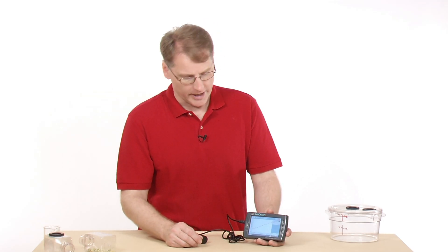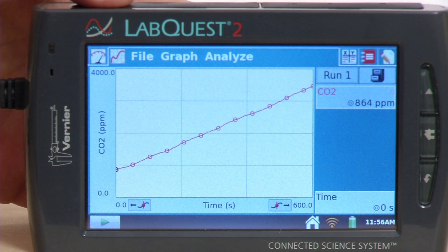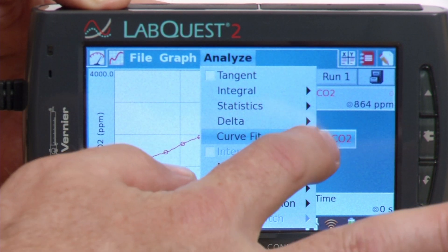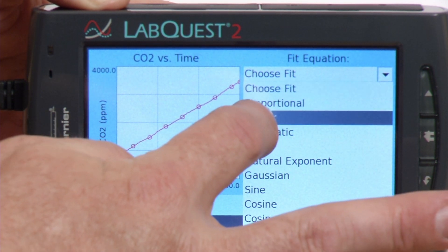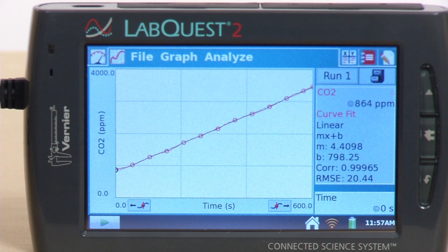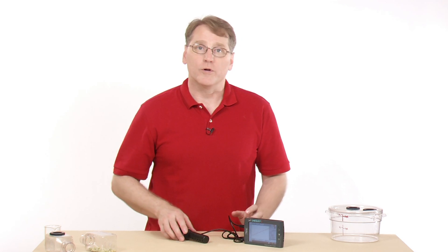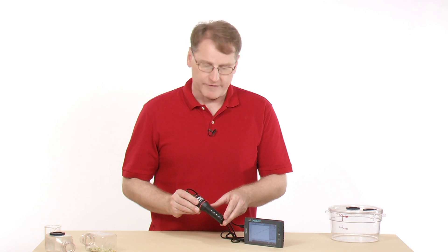We've finished our data collection, and it looks like our CO2 level was increasing nicely. The CO2 was increasing fairly constantly, so let's run a curve fit to look at the rate. Going to Analyze and then Curve Fit, I'll check the box next to CO2 and try a linear fit since it looks linear. The fit looks good, and we have a slope of 4.4 parts per million per second — so it's increasing at a constant rate. This sensor is used widely for biology and biology-related experiments. It's definitely a good one to have, and it allows you to measure things that would be very difficult to do other ways.